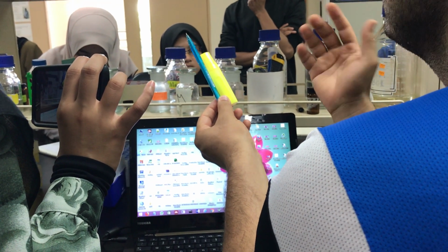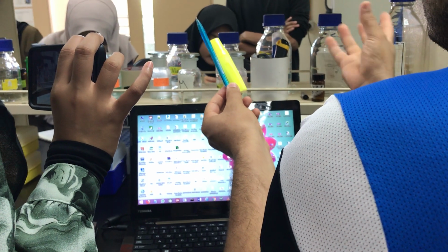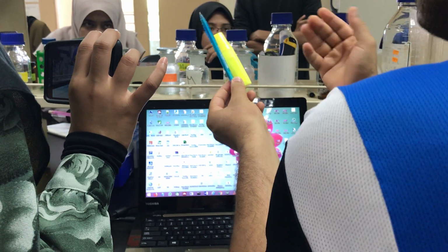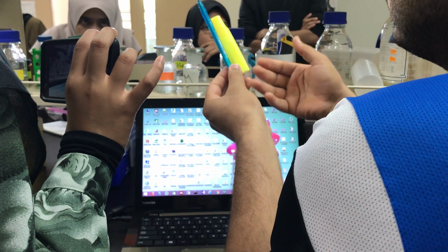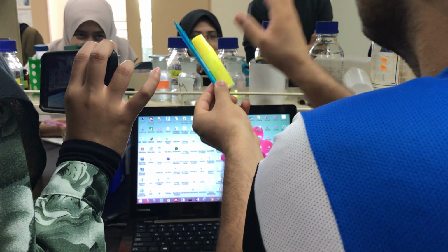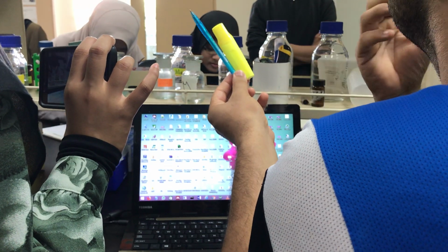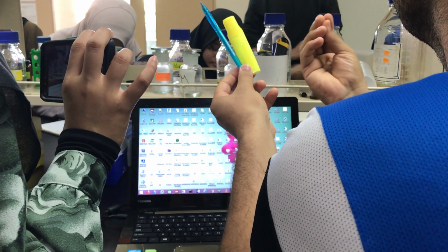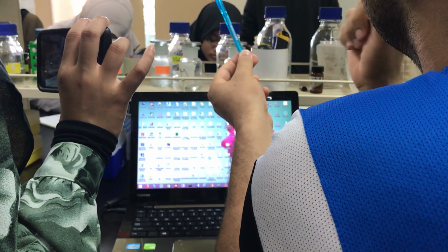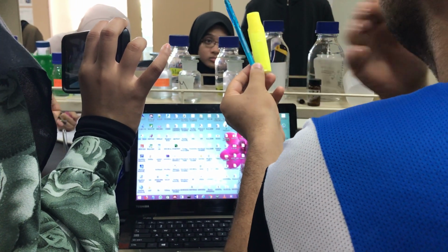That means it will just run further only so we can take the data. But this data cannot go to further publication or be used for a model because the beginning is wrong. I mean, the data is not wrong, it's that there is no significant difference. The model needs at least one extract with low activity or non-active. But if you give it all the same, from the beginning it will reject the data.